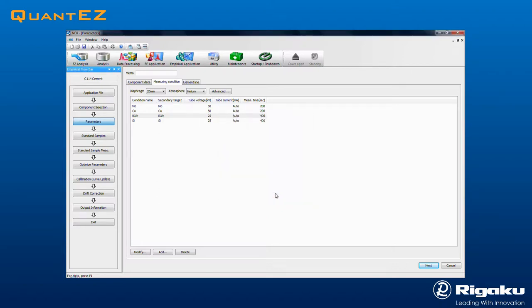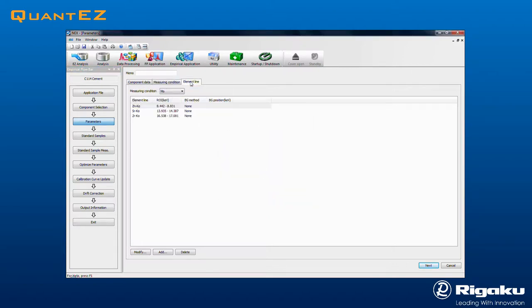Measurement atmosphere, either air, vacuum, or helium, may be selected. Note that the elemental line associations are predetermined for the optimal measurement conditions.